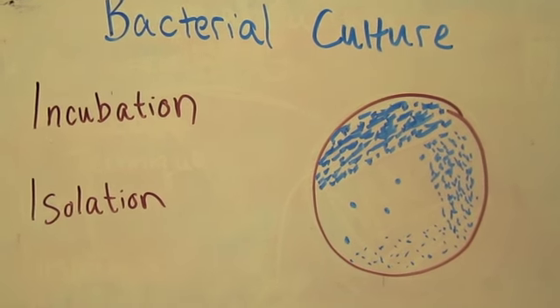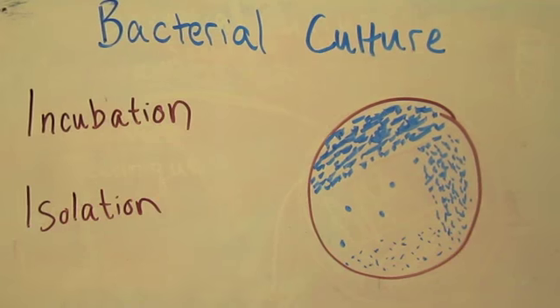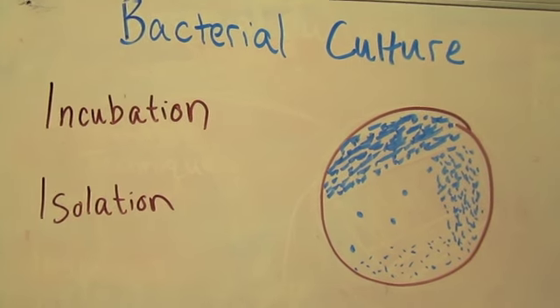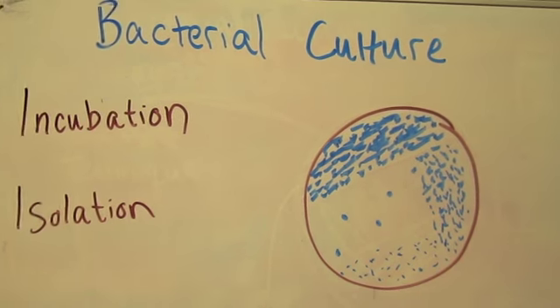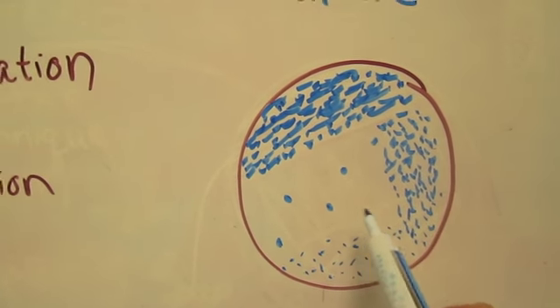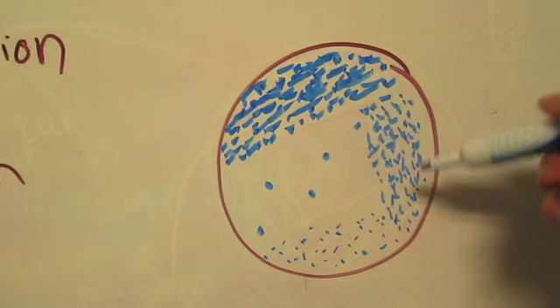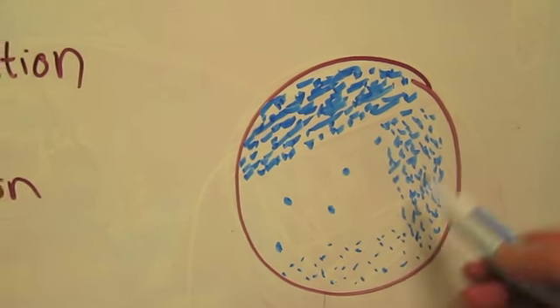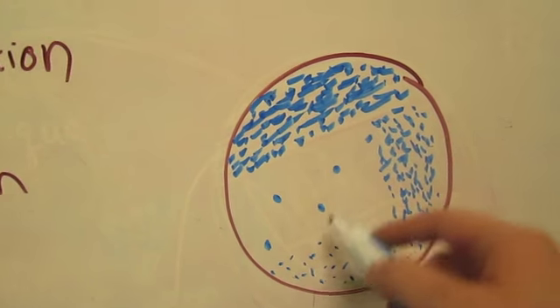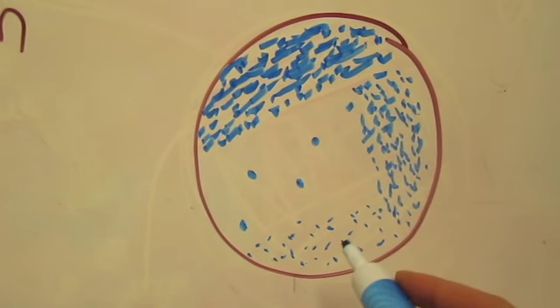After incubating the petri dish and allowing the proper time, temperature, and atmosphere conditions for the bacteria to grow, you'll eventually find the isolated colonies in the third and fourth quadrants, which will be right here. As you can see, these bacteria grew and they're very crowded and overlapping, but as it's spreading out, you'll find that single bacteria were spread into this region and they were happy and they were able to grow into large mounds rather than these smaller dots.